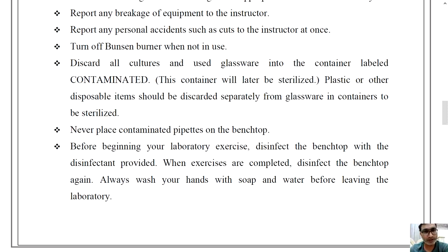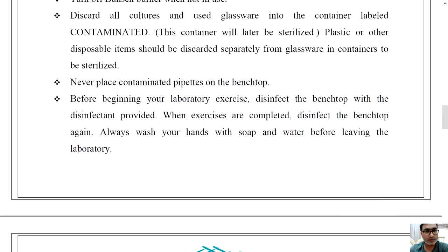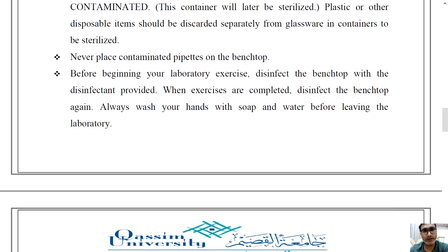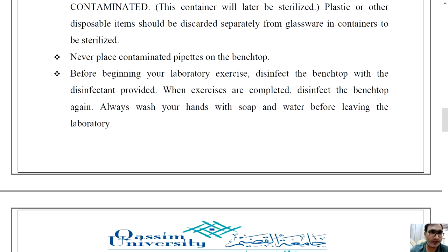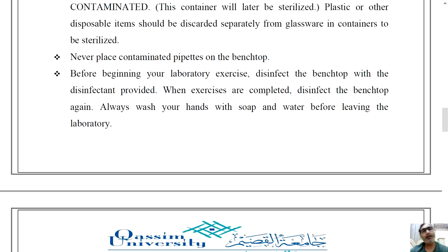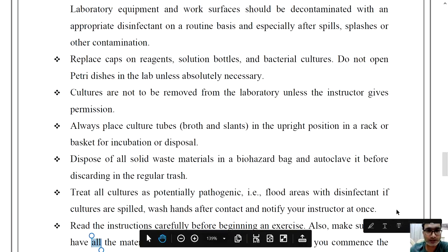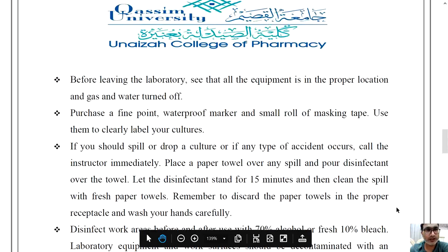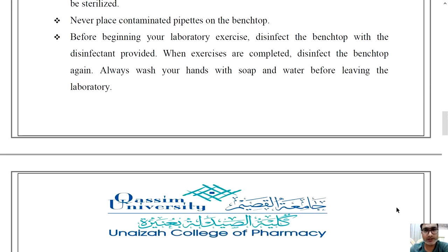Never place a contaminated pipette on the bench top, otherwise your bench can become contaminated and other people can get infected. Before beginning your laboratory exercise, disinfect the bench top with the disinfectant provided. Whenever you are working, the table must be cleaned properly with the disinfectant, and once you finish your exercise, clean it again with the same disinfectant.